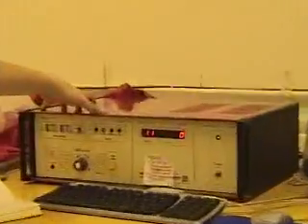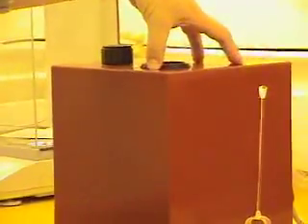Hi, my name is Kurt, and today I'm going to show you how to use the Kappabridge for doing anisotropy of magnetic susceptibility. And here we have the Kappabridge, and it comes in three parts. There's a computer that controls it, there is the main unit, and there is the sensor over here where we put the samples in. And before we do that, I'm going to show you how to load samples in.